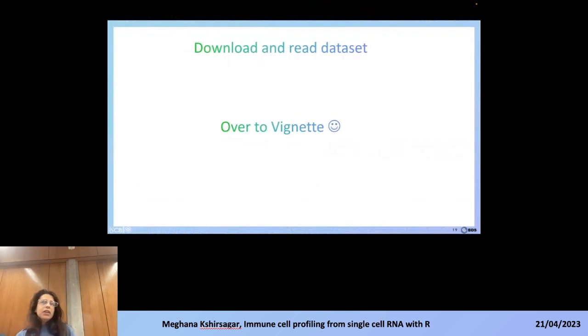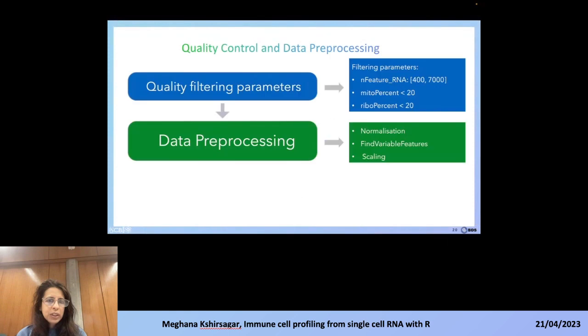Then, once we combine all these samples together, we have to make sure that there may be some cells within each of those samples that may not be of any use to us. They may be dead cells, or they may be just cells that are being repeated. So we have to make sure that we have the right viable cells. So then we do the filtering. In filtering, we will use the following filtering features. You can have a filter on the features.